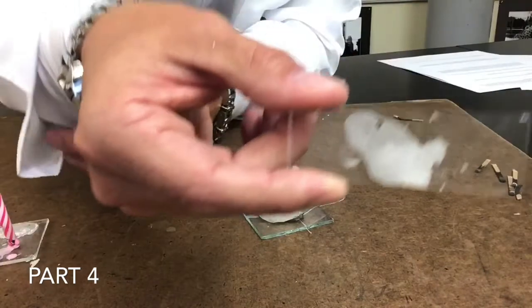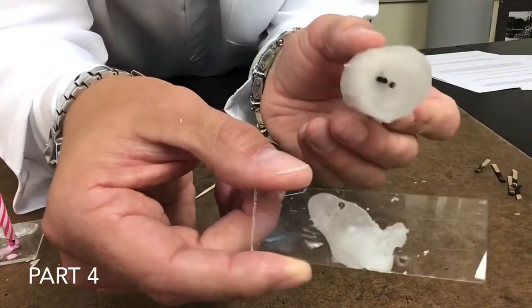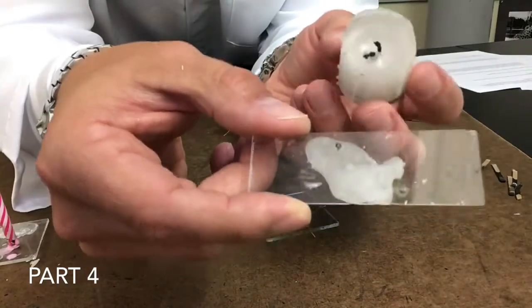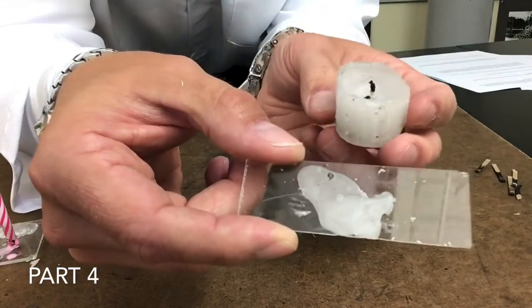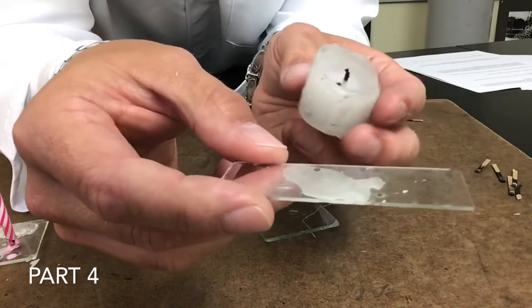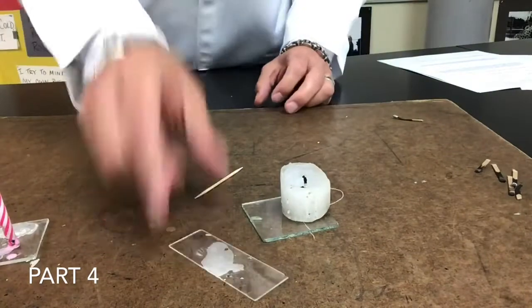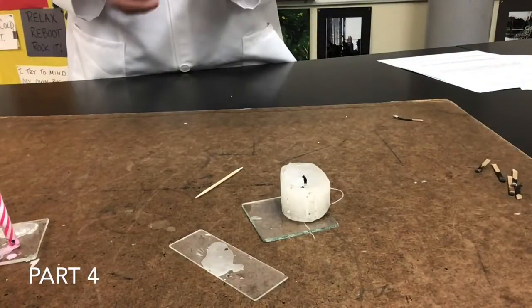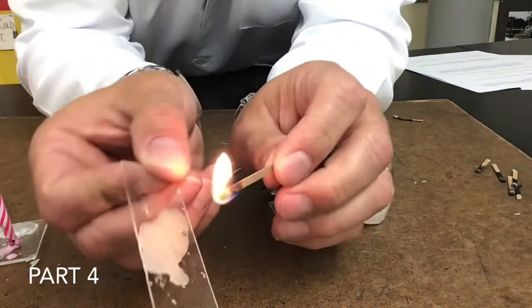If you think about this, this is going to be a controlled experiment. Why? Because the candle is made of wax and a wick. What we're doing is taking away the wick now, changing one thing. And by changing one thing, now you've created a variable. And we can see if the candle needs to work with a wick or if we can just burn the wax. So let's try that out. I'm going to get myself a match and I'm going to attempt to light this wax and see if it catches on fire, just like a candle would. So here we go.